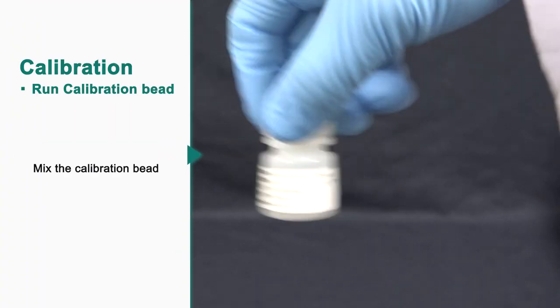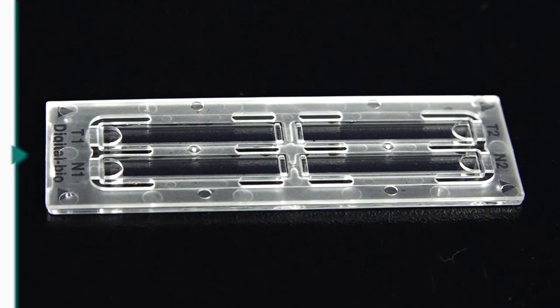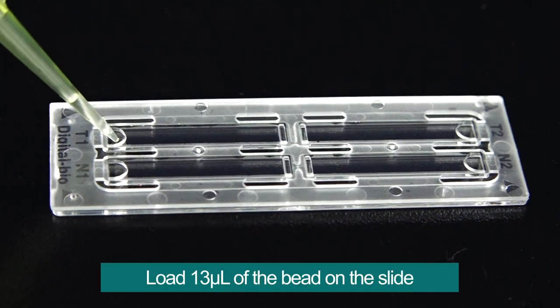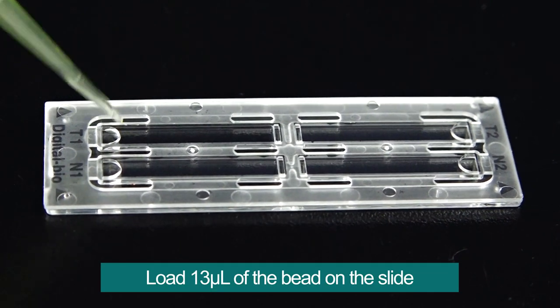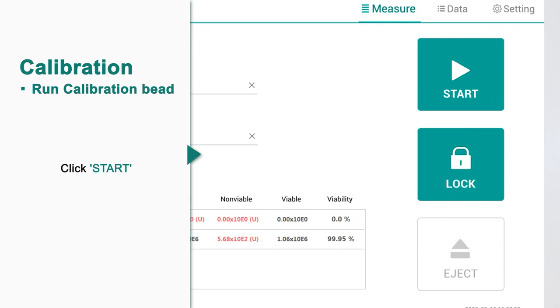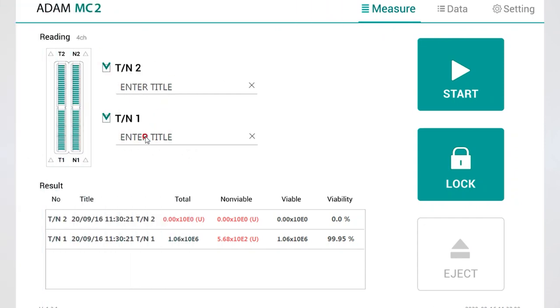For the test, mix the calibration bead and then load 13μL of the bead onto the slide. Next, insert the slide into Adam MC2 and click the start button.